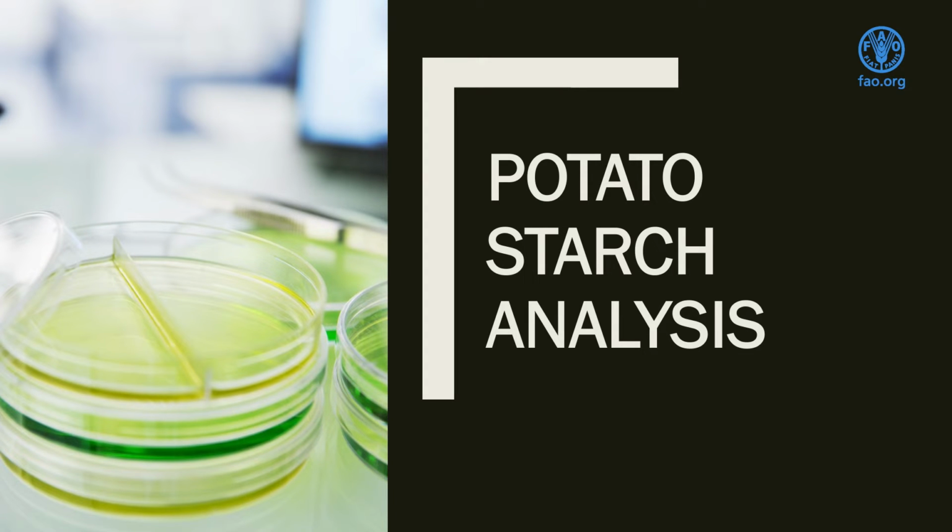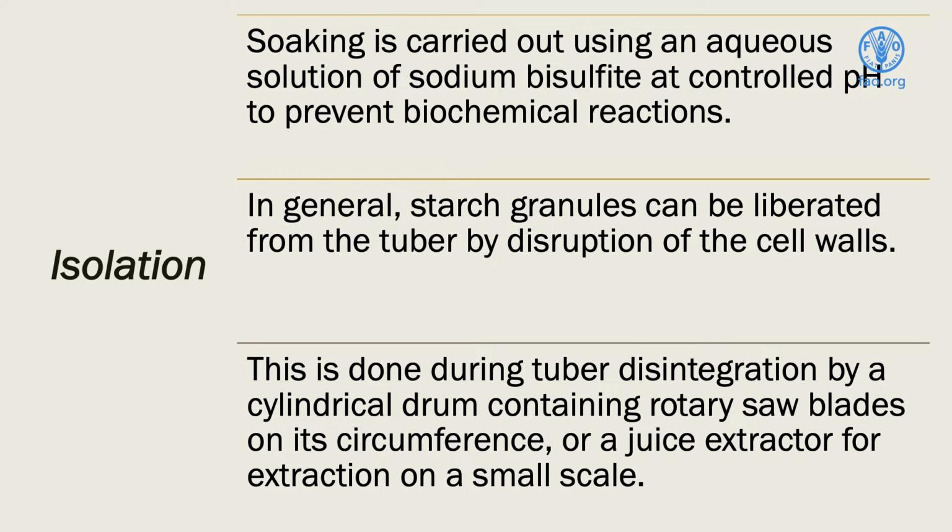So next part is potato starch analysis. First one is isolation of potato starch. It's very simple. Soaking is carried out using an aqueous solution of sodium bisulfite at controlled pH to prevent biochemical reaction. Actually, this one is some kind of enzyme-induced browning reaction. Actually, PPO, oxygen, and polyphenol can react and make some yellow pigment. To inhibit this biochemical reaction, we add sodium bisulfite.